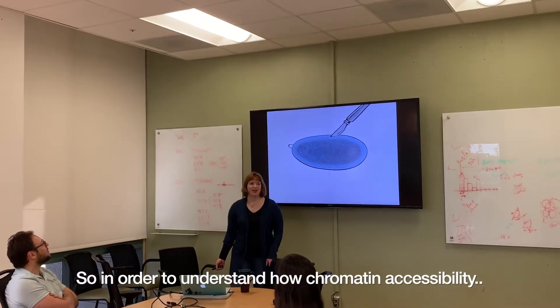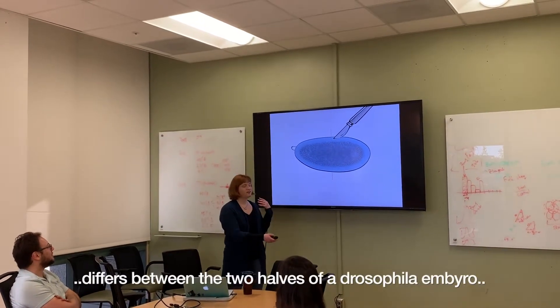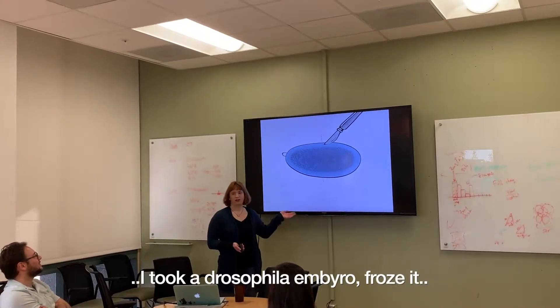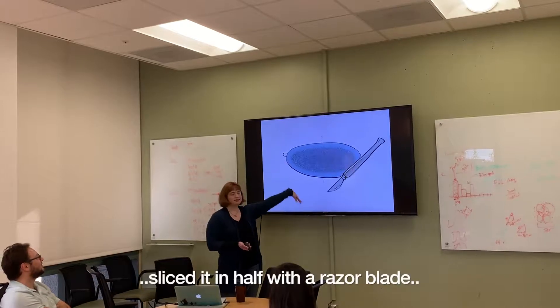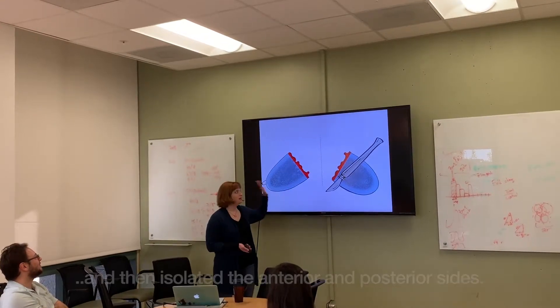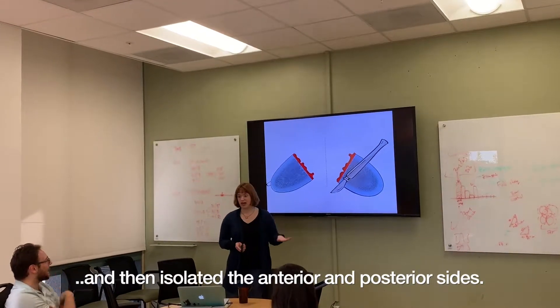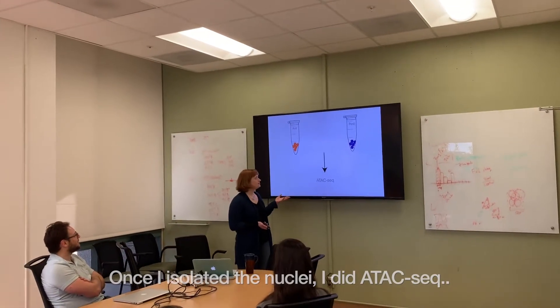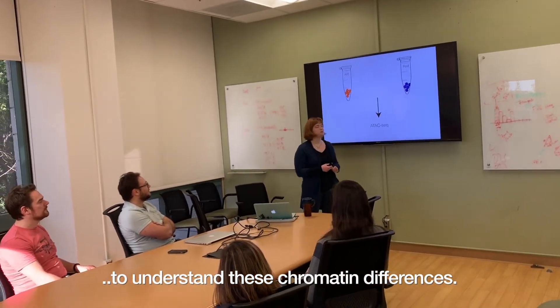In order to understand how chromatin accessibility differs between the two halves of a Drosophila embryo, I took a Drosophila embryo, froze it, sliced it in half with a razor blade, and then isolated the anterior and posterior sides. Once I isolated the nuclei, I did an ATAC-seq to understand these chromatin differences.